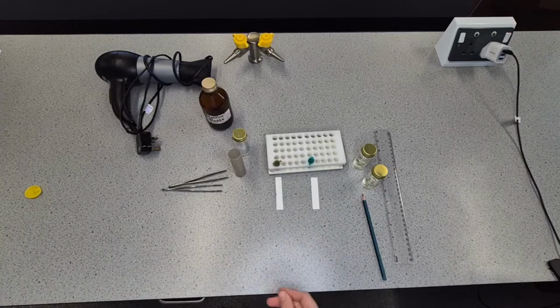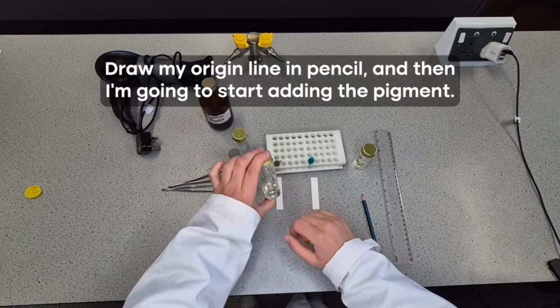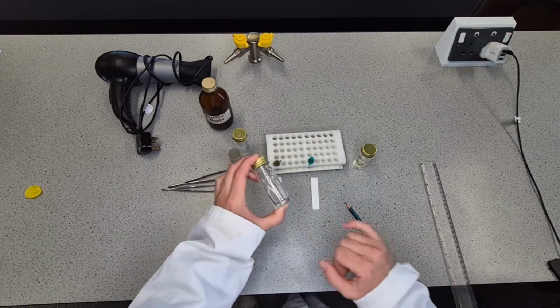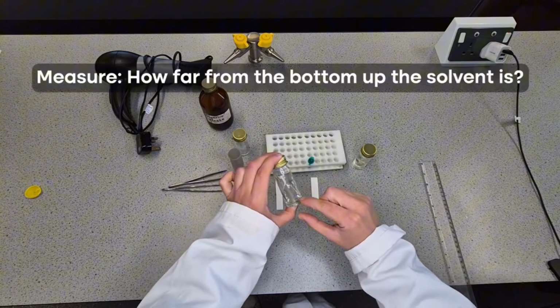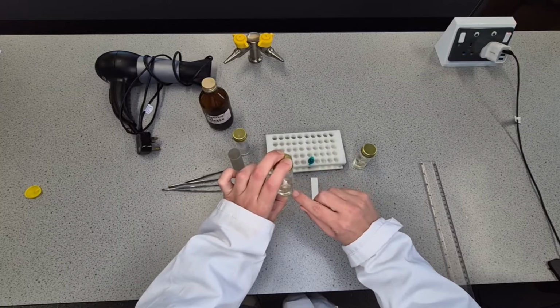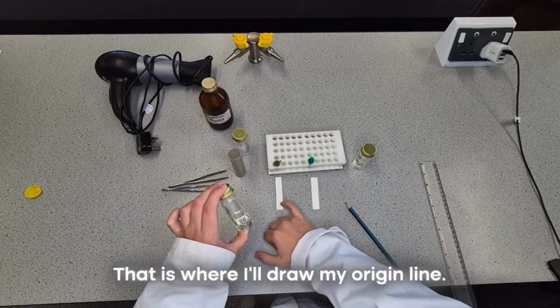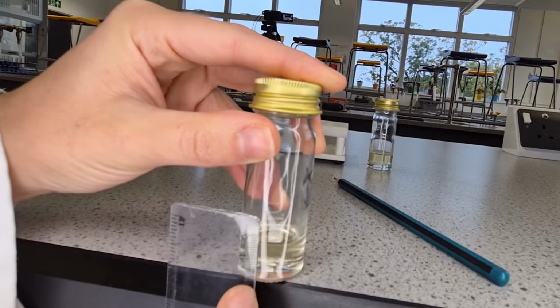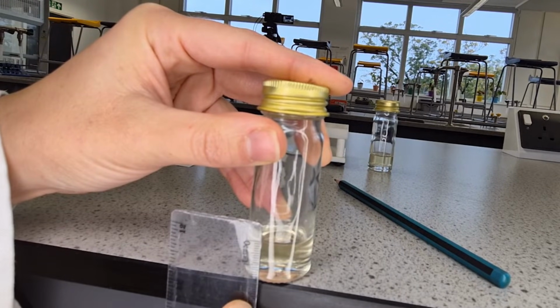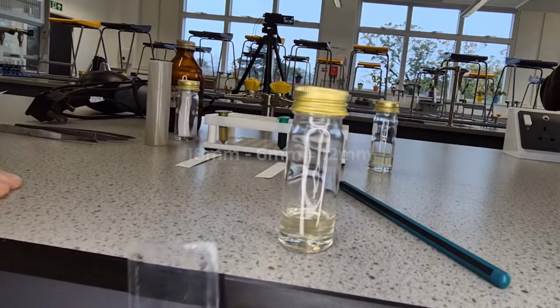And what I then need to do is draw my origin line in pencil, and then I'm going to start adding the pigment. But I need to work out at what distance up to draw my solvent front. So what I'll need to do is measure how far from the bottom up the solvent is, take that bit of glass distance away from that to know how deep in the bottle the solvent is, and that is where I'll draw my origin line. So it looks like 6 millimeters, and that is 18 millimeters. So 18 minus 6 would be 12.